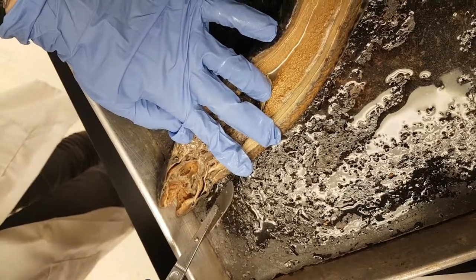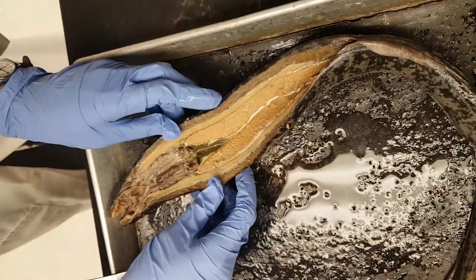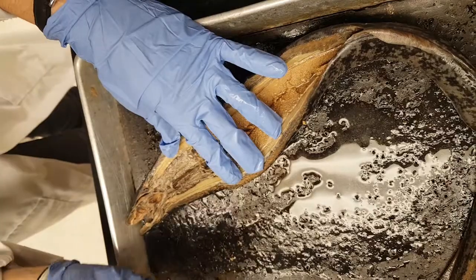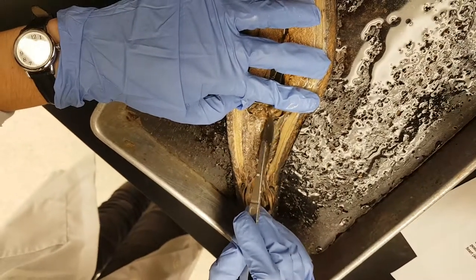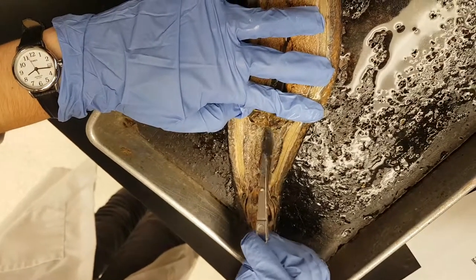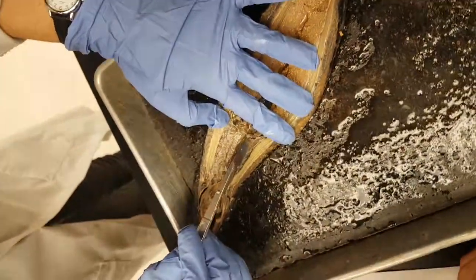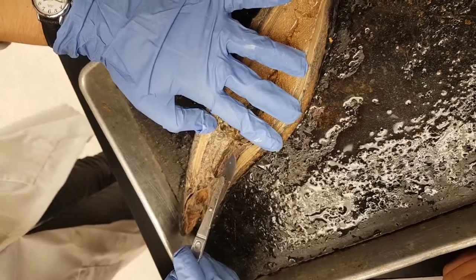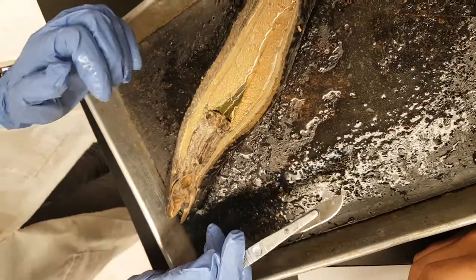I got the dorsal aorta — can't see it yet, it's on the transverse section. And your posterior cardinal vein also. Your heart: this here is the entire heart. This is going to be your ventricle, and this is going to be your atrium. Because I cut it, you cannot see the sinus venosus, but you would be able to see that one on the transverse cut. Everything else is either an external structure or you have to see it on the transverse cut.